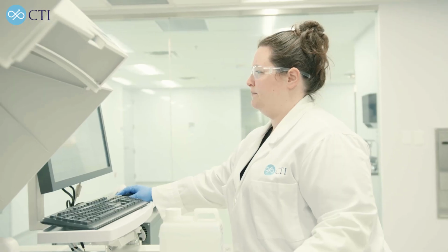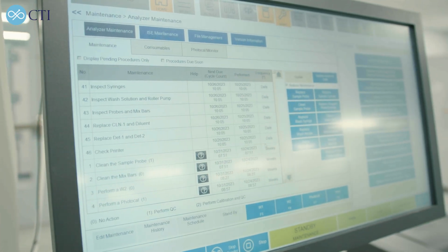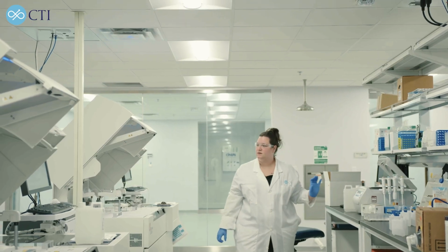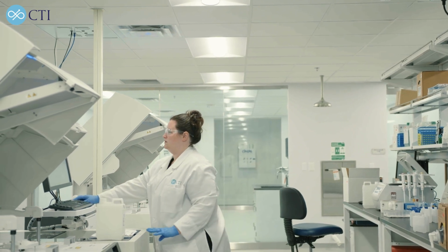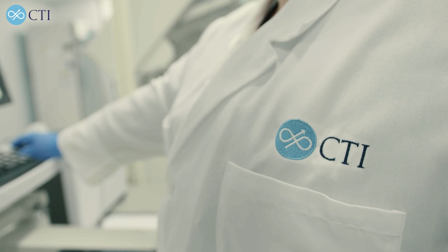So after sample collection kits are sent out to investigator sites, patients come in, samples are collected from those patients, and then those samples are returned back to CTI laboratories for proper testing, storage, forwarding on to other testing facilities, or in some cases just being received and put into long-term storage. However, it's not as simple as just receiving those samples back in. We do what we call accessioning. It's registering the samples into our database.